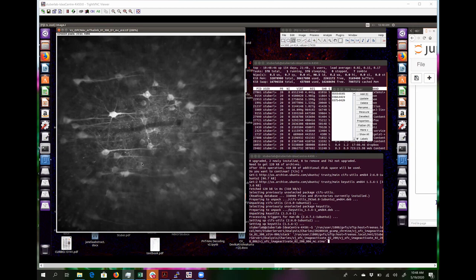Yeah, exactly, it's super important. The only thing I can tell you as a standard to follow, the strictest standard you can follow, is to do your analysis using this method, then do your analysis using some variations of your parameters, and see if your results change. That's a good point, in both directions, right?